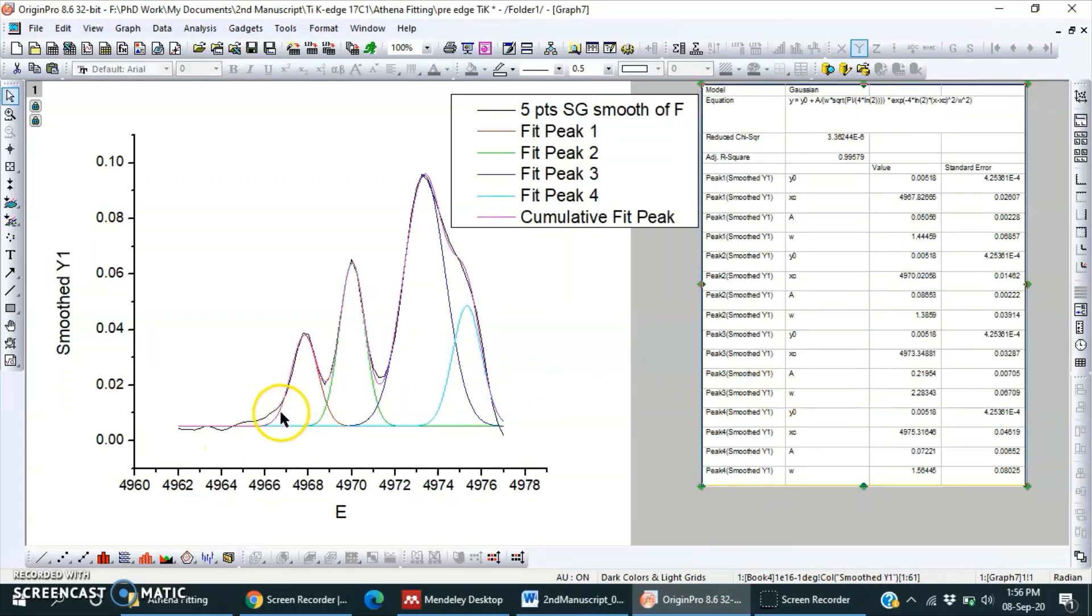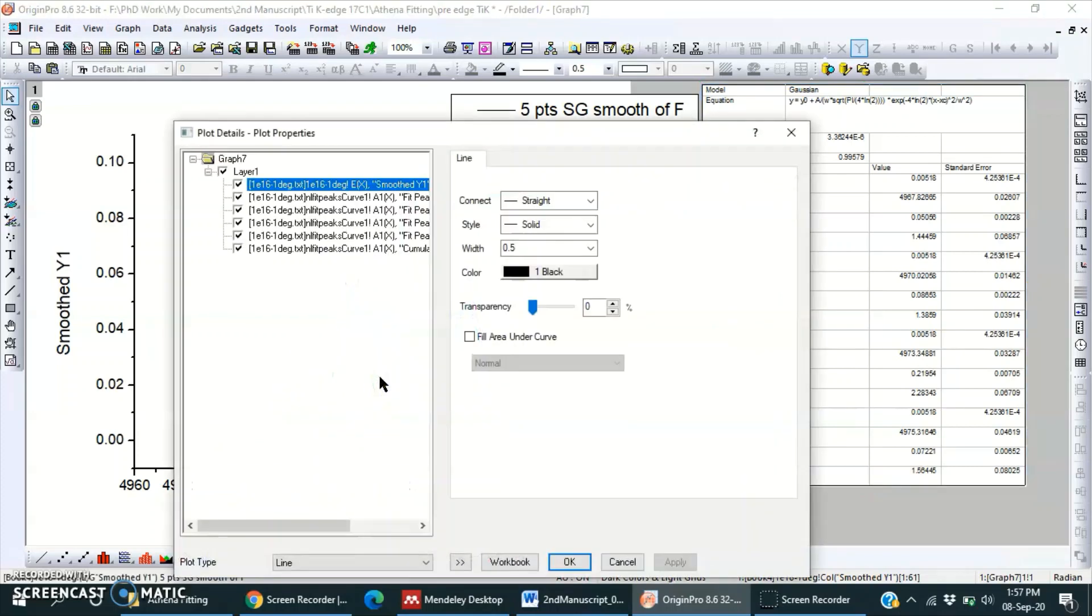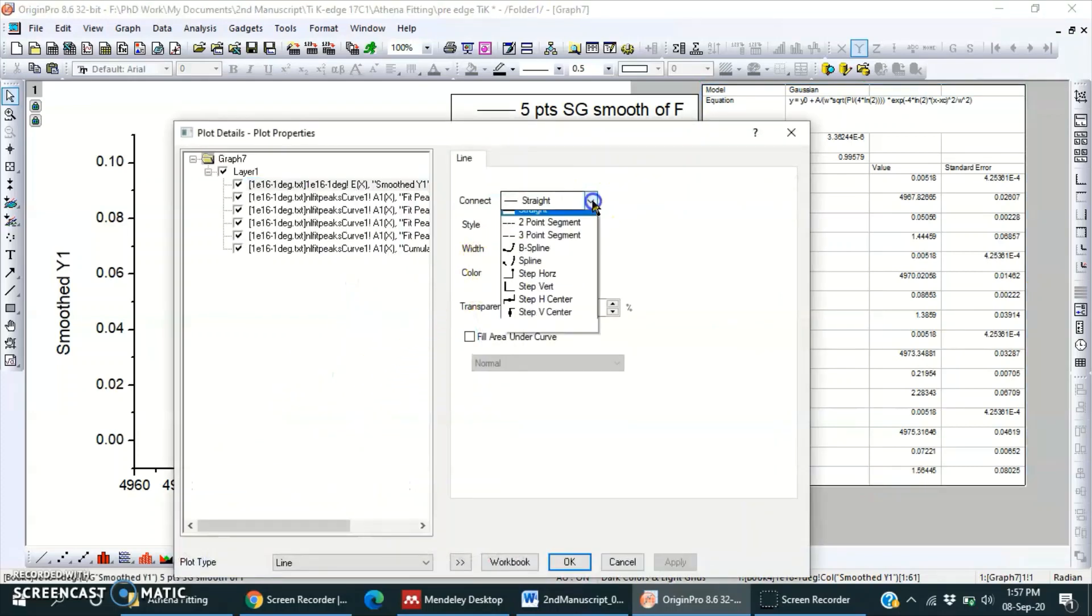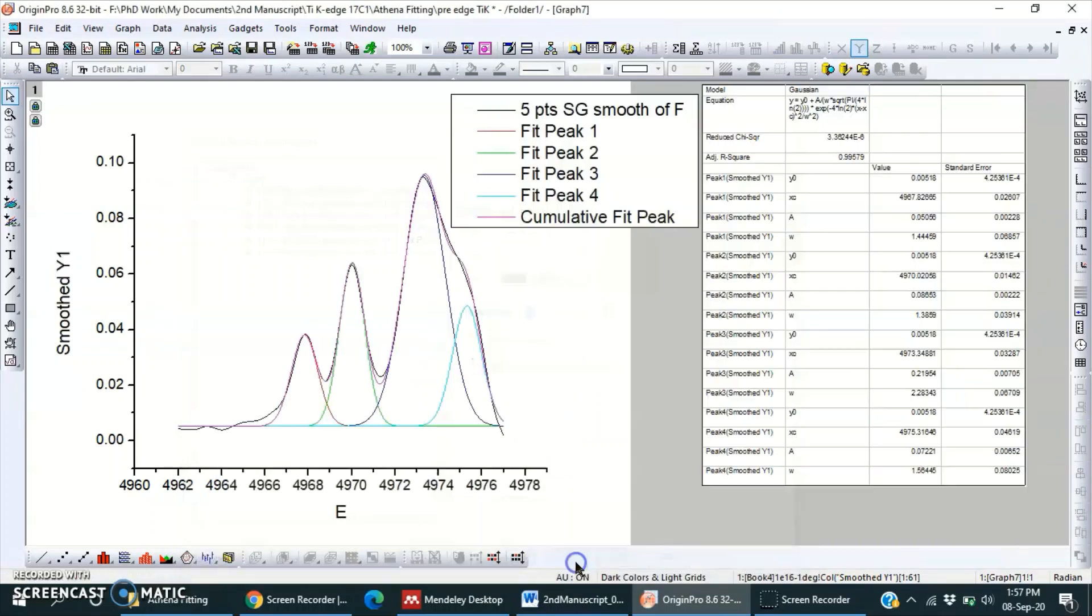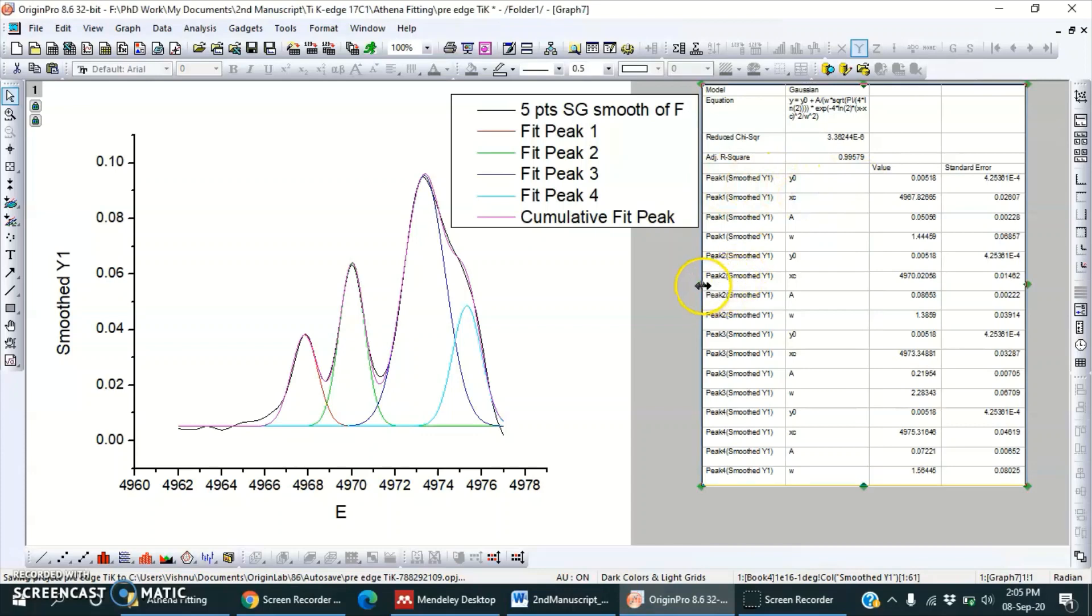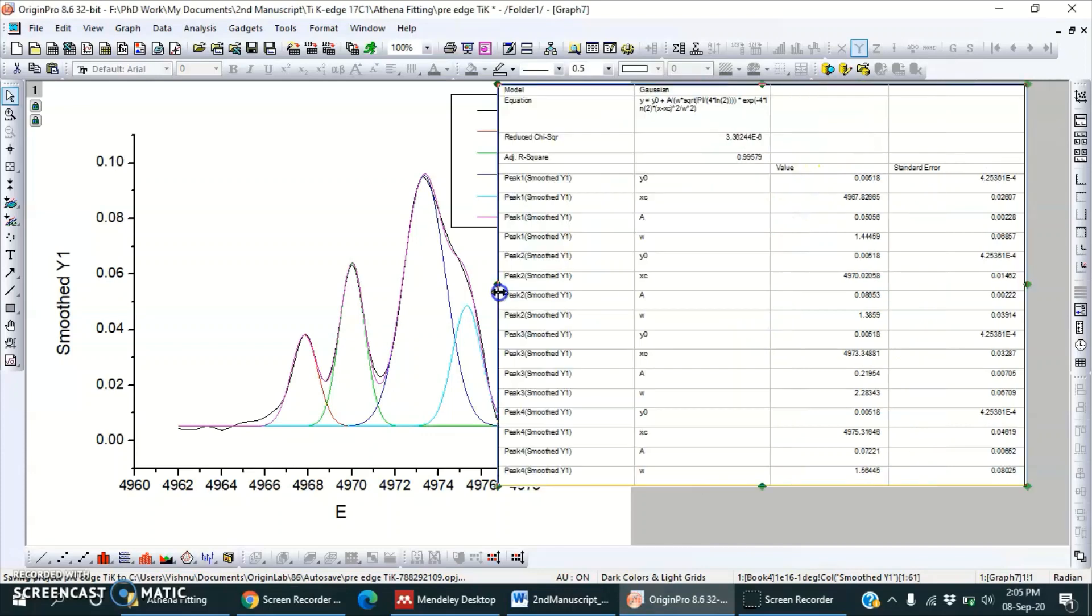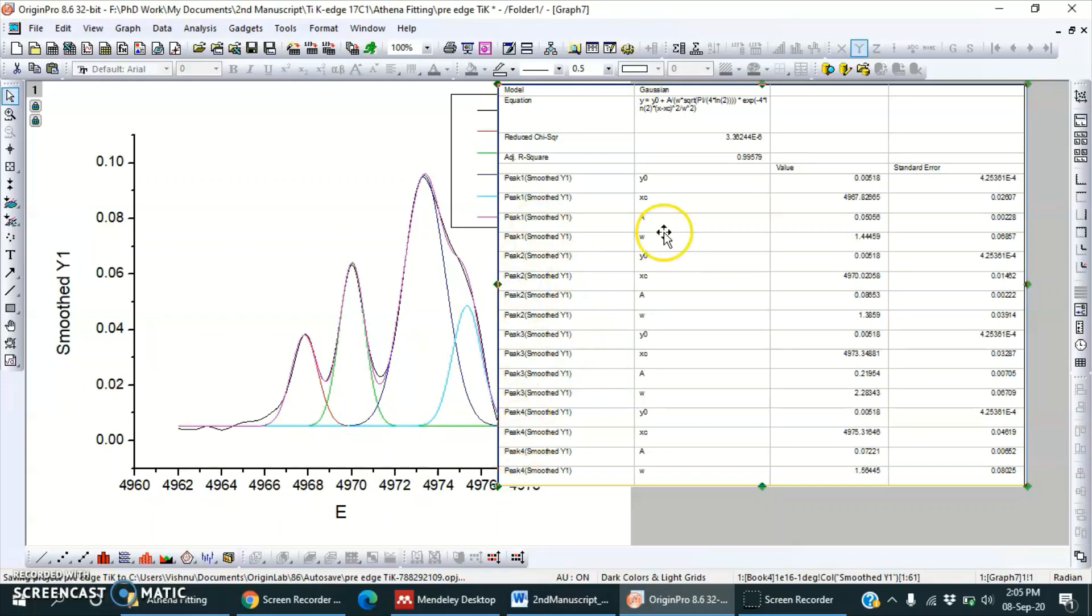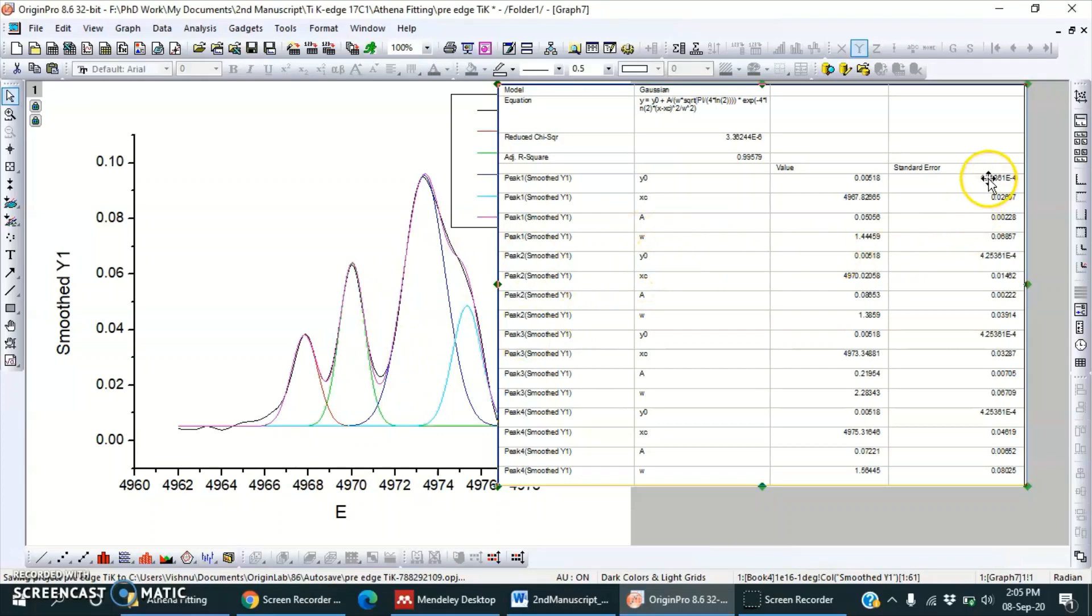Hmm, this region is not pretty good, but we can try while doing a baseline. From this table we can note down, and this is the peak position of peak 1, then this is peak 2, peak 3, peak 4. So Xc is position, A is intensity amplitude, and W is FWHM, and these are the corresponding errors.